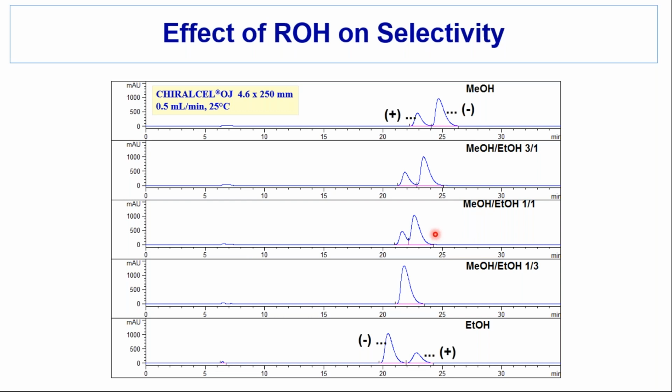When I saw this, I thought, well, this is interesting. Probably increasing one of the alcohols would improve separation. I had an inline polarimeter, but I had also isolated or separated these enantiomers, so I had spiked the sample with one of the enantiomers so that I could track the order of elution in screening. So as I went to 3-to-1 methanol to ethanol and 1-to-3 methanol to ethanol, I saw a difference in retention and separation.